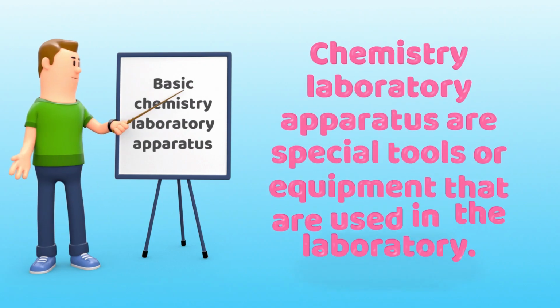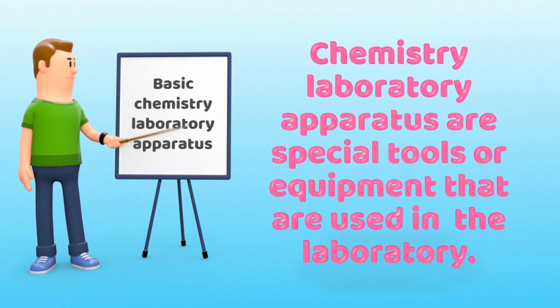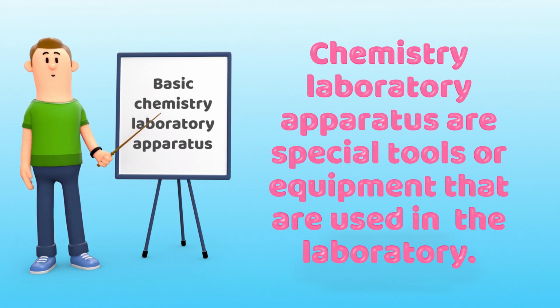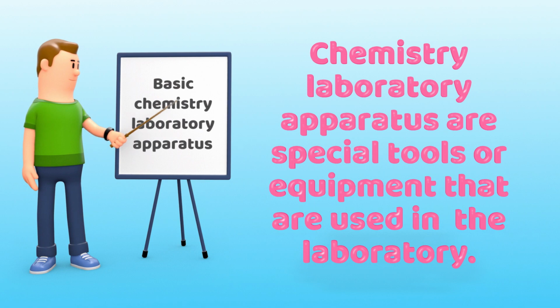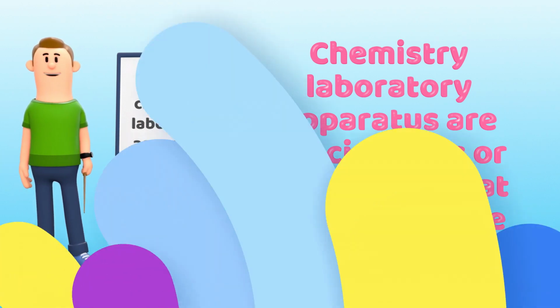Let's now learn about chemistry laboratory apparatus. What are apparatus? These are equipments used during practical experiments.